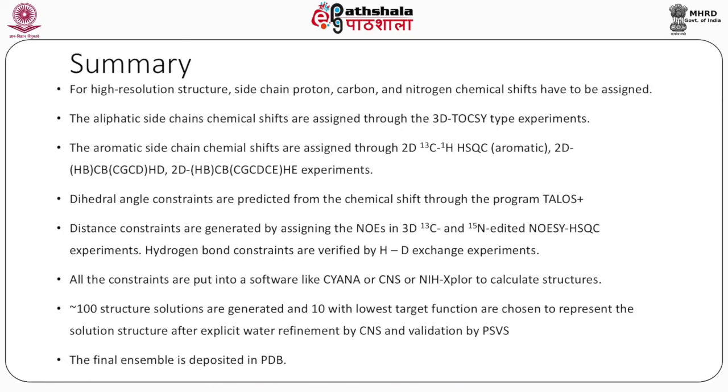Approximately 100 structure solutions are generated and 10 with lowest target function are chosen to represent the solution structure after explicit water refinement by CNS and validation by PSVS. The final ensemble is deposited in PDB and analyzed for various purposes.